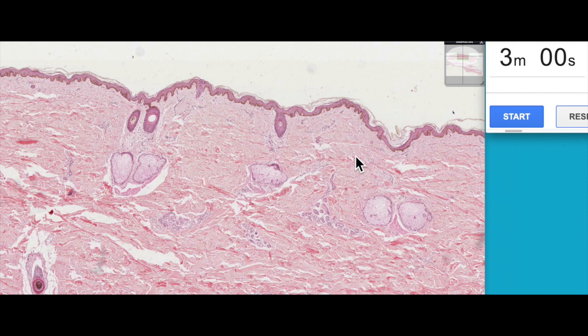G'day everyone, Jamie Chapman for 3 Minute Histology. We're continuing our exploration of the epidermis. In the previous videos I've had a look at an overview of the integumentary system, the sub-layers of the epidermis, and some of the finer details about the cell types found within the various sub-layers. What we were using was a resin section, and of course not everyone is going to have access to a resin section. Most people will probably be looking at paraffin-sectioned skin, so that's what we're going to look at today — the epidermis of a paraffin section so you can identify the various sub-layers and components.